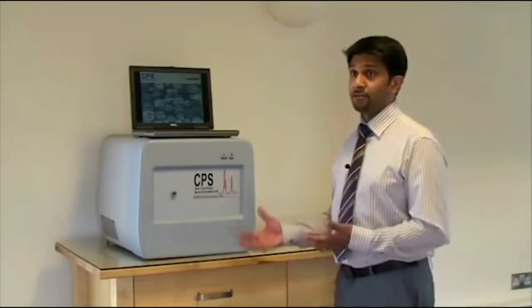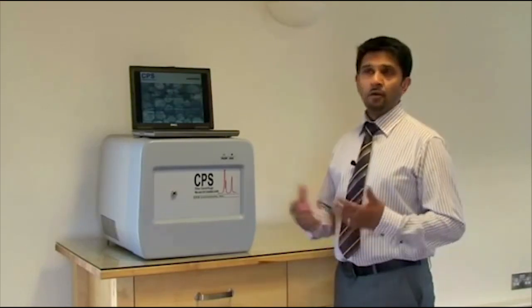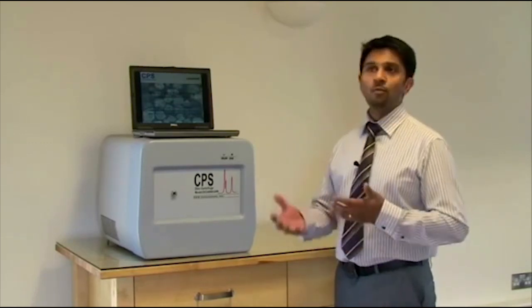So what are the main features and benefits of the instrumentation? As everyone will know there are many other particle sizing instruments out there. I always like to say that these other techniques are very complementary and you should always use more than one technique when you're characterizing your material.